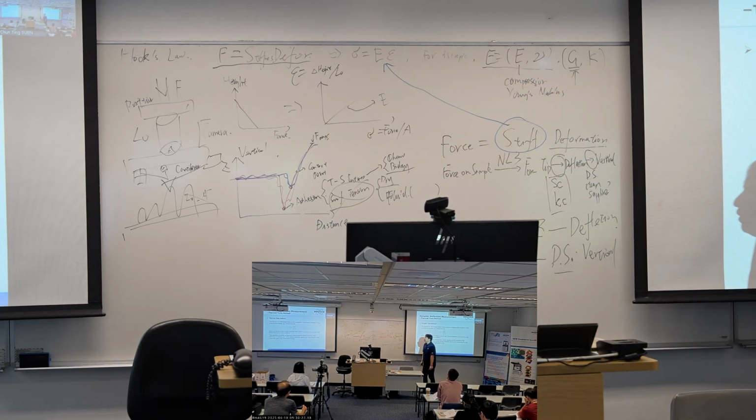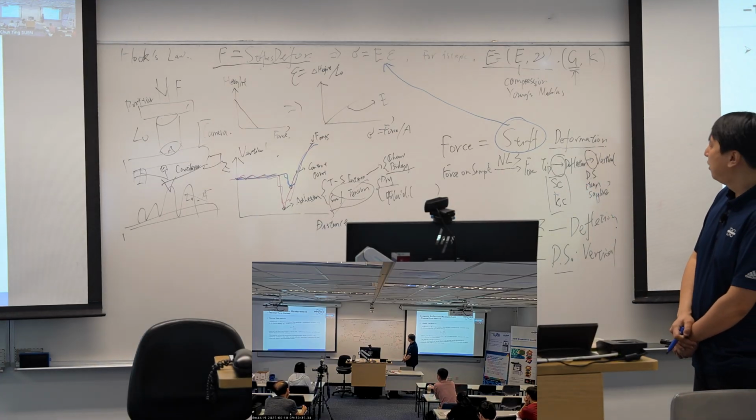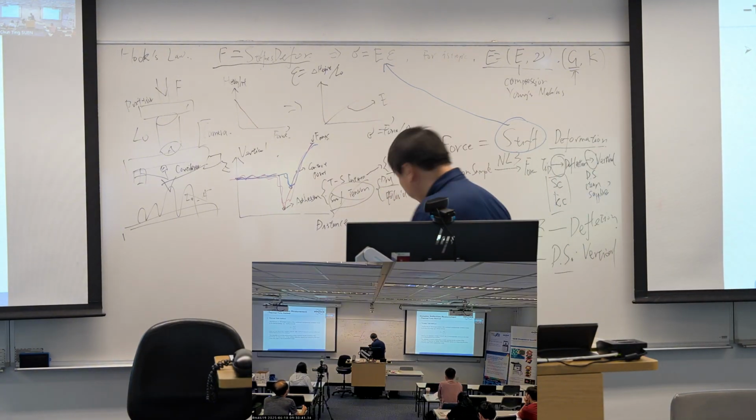Okay, so yesterday we introduced this AFM technology, and we stopped at the spring constant calibration. So today we will continue.